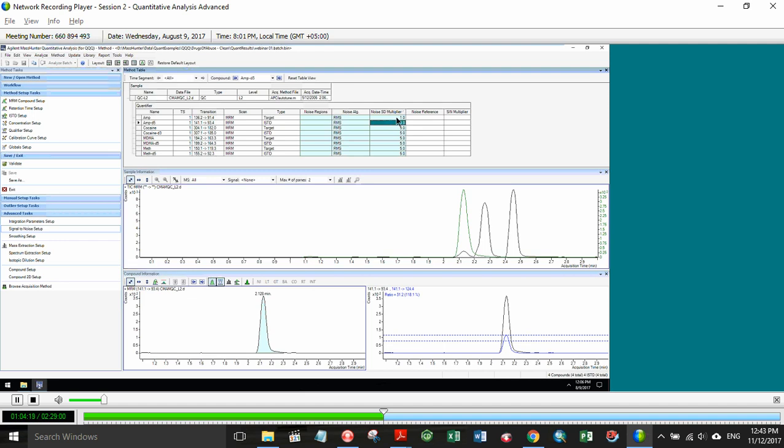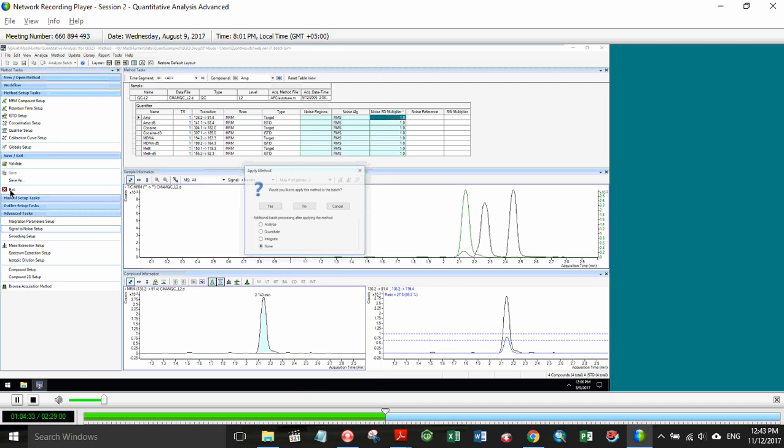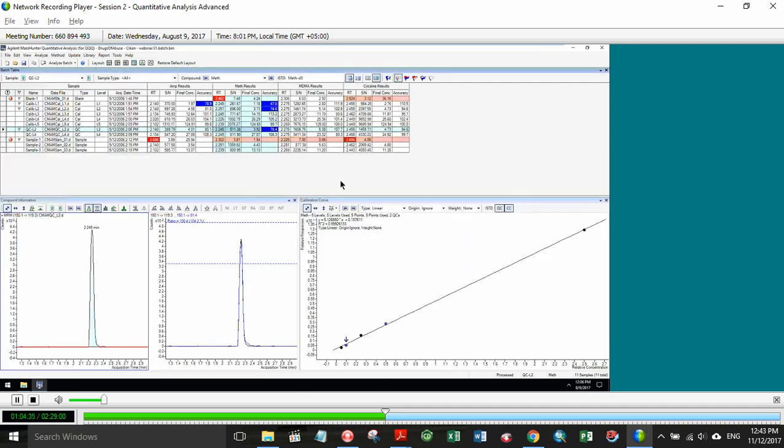Okay, and in this example, analyze that batch first, and then we have different noise values right now. And did everyone just see what Howard just did there? A little feature that we really didn't mention was he auto-fit the columns. That's a nice one, especially when you're shuffling around and numbers have changed as some of these got bigger, since we obviously lowered the noise used for the calculation. So auto-fit is another nice little tool for making it easier to see things.